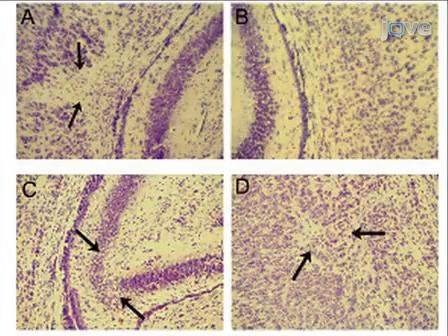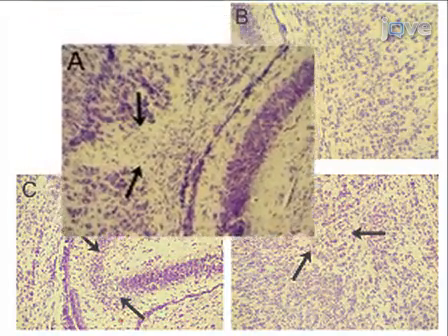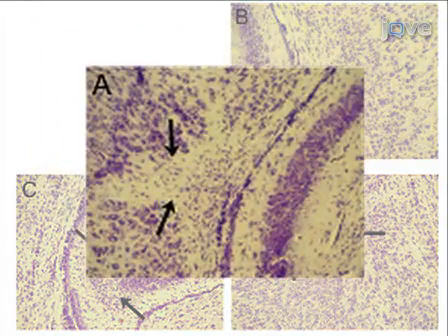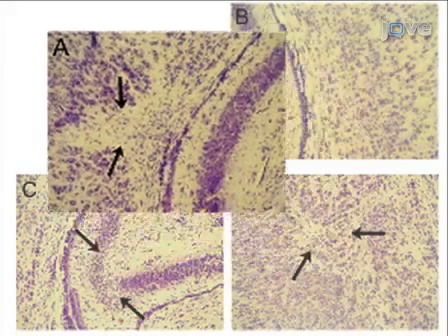Here are some representative results from mouse models of periventricular leukomalacia, or PVL. First, a neuropathological examination of coronal sections stained with hematoxylin and eosin through the entire forebrain reveals focal necrosis in the central white matter of the cerebral hemisphere ipsilateral to the carotid ligation. In the focal necrotic white matter, there is marked increase in cellularity consisting of macrophages and reactive astrocytes, as is characteristic of focal human PVL.